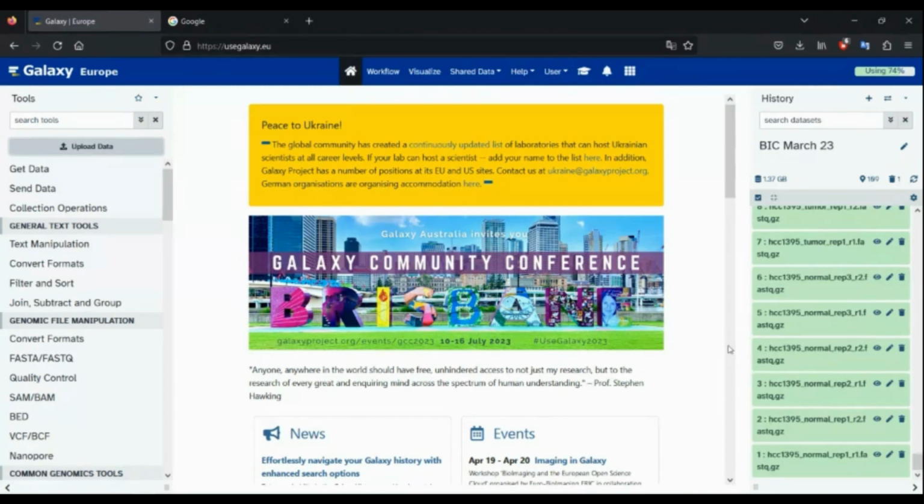Now, just general info on the type of reads that we have. The paired end reads are 151 mers, so k-mers. Maybe the bio people are not familiar with the term, so it just means that the DNA we have sequenced has been cut into small strands of 151 nucleotides each. That's what 151-mers means. This was generated using Illumina technology, and the instrument used is HiSeq.